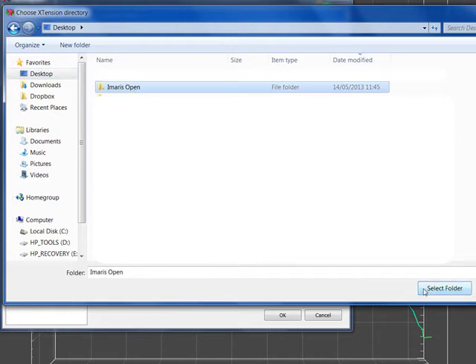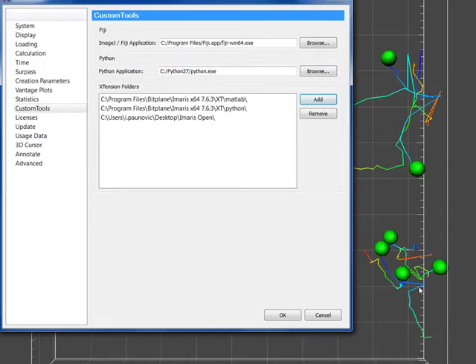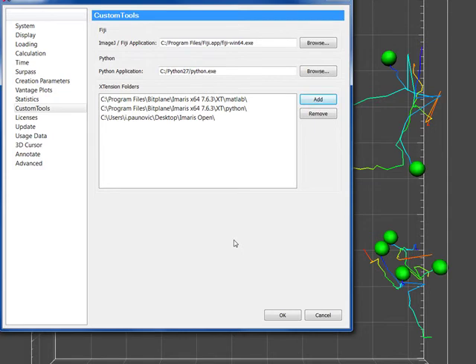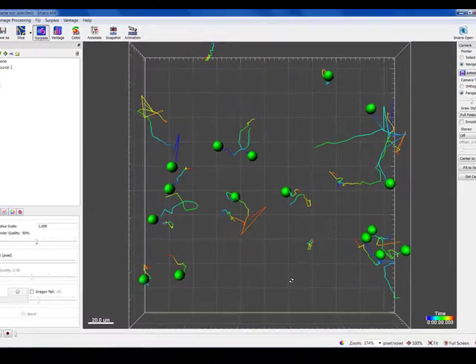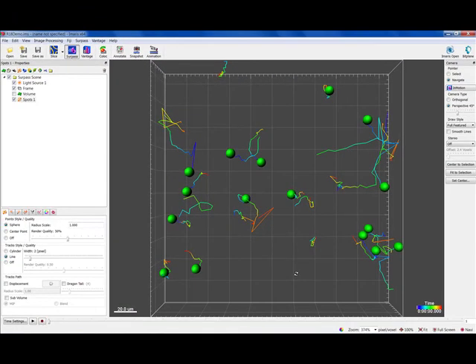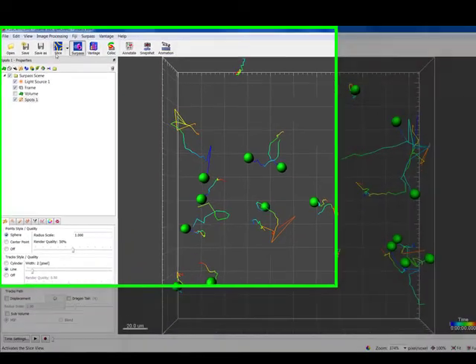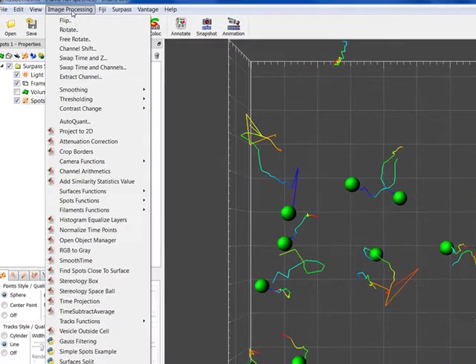Once the path is established, Imaris automatically updates its lists of available extension files within that folder. So, you can now download any new extensions into the same folder and these will be added automatically. As soon as the displayed path is confirmed, the extension is integrated into Imaris and available for use.